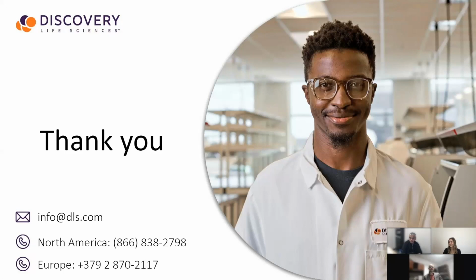Great, thank you. So you are extracting with the Covaris from FFPE skin biopsies and afterwards also shearing with the Covaris? Or what extraction do you use prior to Covaris? I think I blended question number two with the last question, thinking it was the same one. The answer is yes, we use Covaris at both steps, extraction as well as gDNA shearing, for every single FFPE sample that we process through the lab.